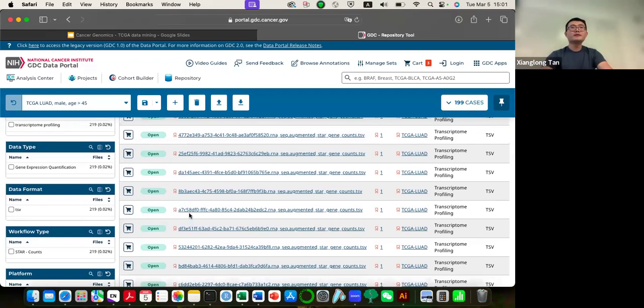In my own research experience, for example, I use a model pair of a lung cancer cell line and compare it to real NSCLC patient samples. Technologically, I need to normalize between those two conditions by sequencing depth or something. In this case, probably the raw file is necessary. But most of the time, the post-analyzed files are already enough for our research.